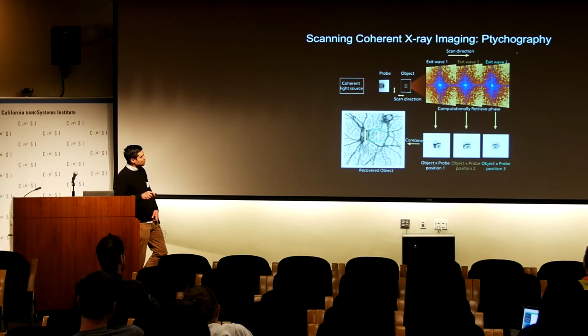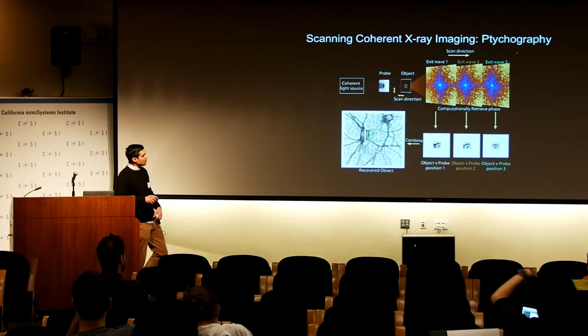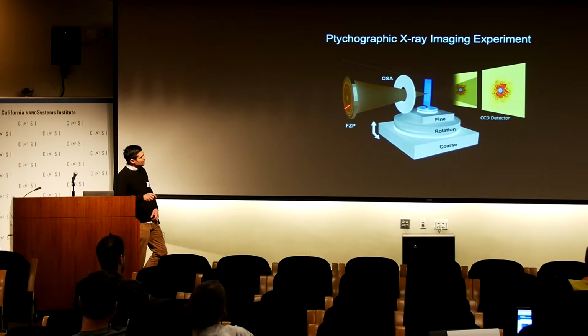So you scan the X-ray beam across your sample in a way that any given location overlaps by a certain percentage of the sample with the adjacent location. So you move over, not quite one beam profile over, and you use that overlap constraint to try to tell you something about your structure. And when you satisfy all of those overlap constraints, that gives you a single two-dimensional projection from all of these individual diffraction patterns.